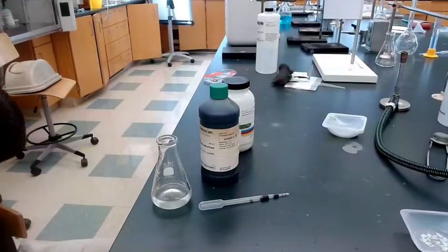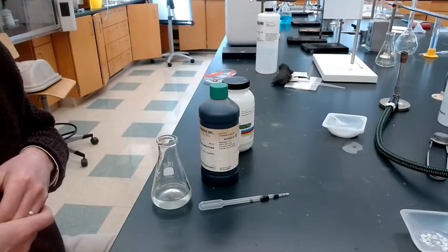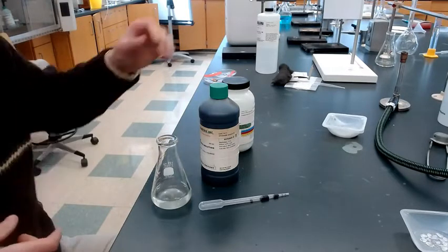So I'm not going to set up a titration for this, but I wanted to show you that we can do titrations not only with acid-base reactions to determine molarities, we can also do titrations in redox reactions.